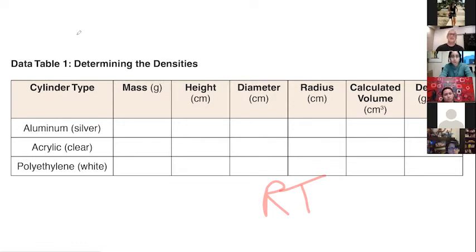Because what happens to the density of water as the temperature goes up? Anybody know? It's more dense. Okay, why do you say that? Because ice floats. But ice is cold, isn't it? Right. So as the temperature increases, the density would increase. Okay, anybody else have an idea? I see where you're thinking, where you're going with that. Okay. Does anyone think it's the opposite?